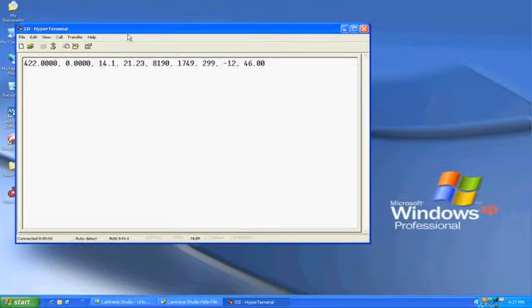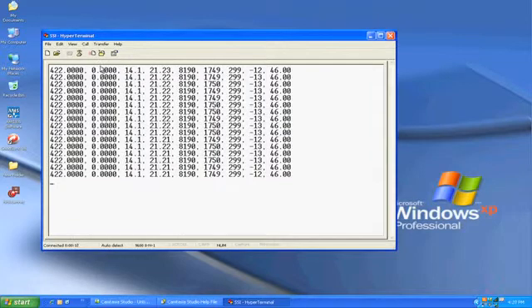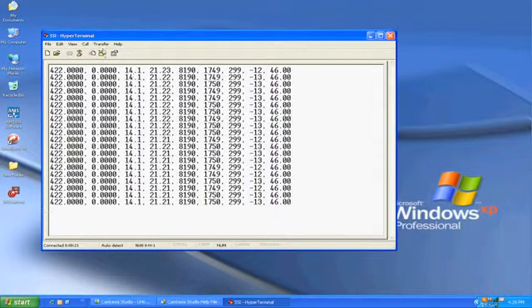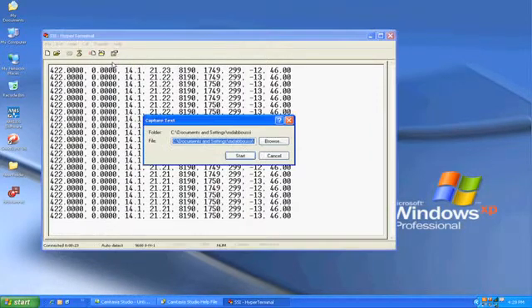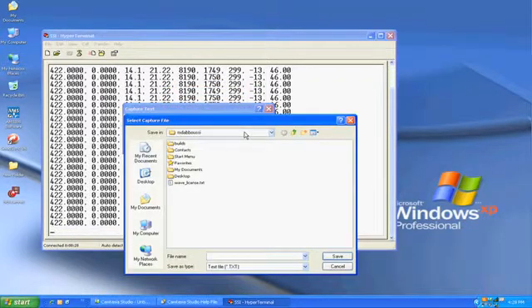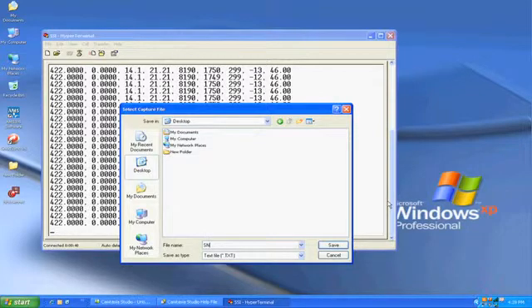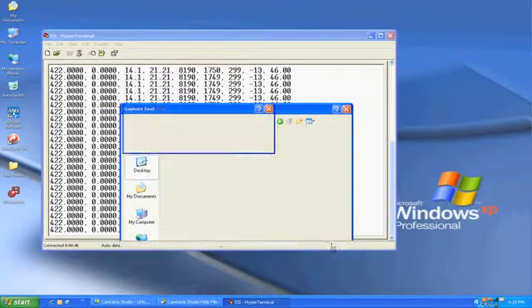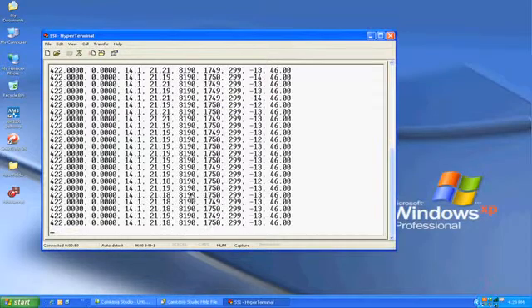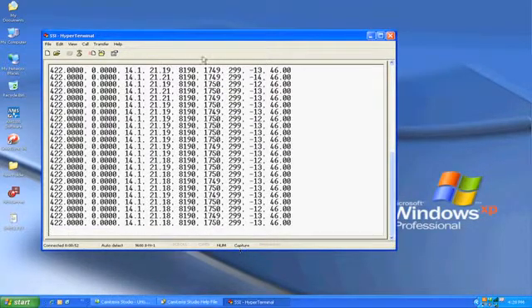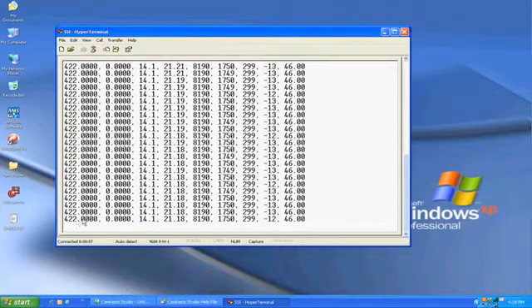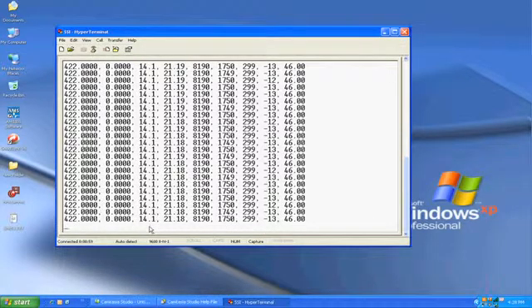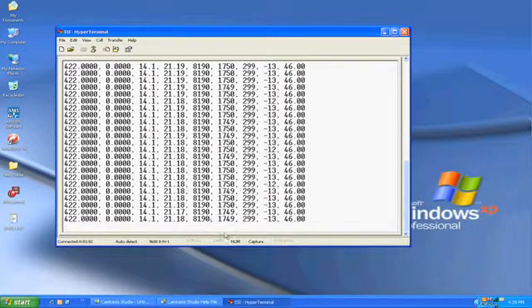Now, this is your streaming data from the analyzer. To save the data, you click on Transfer, Capture Text. Then you would browse. To save the file, I would prefer if you enter the serial number of the unit, click on Start, and notice the capture is bolded on the screen below. That means that all the data currently being streamed has been captured. Previous data would not be captured before the capture sign is on.